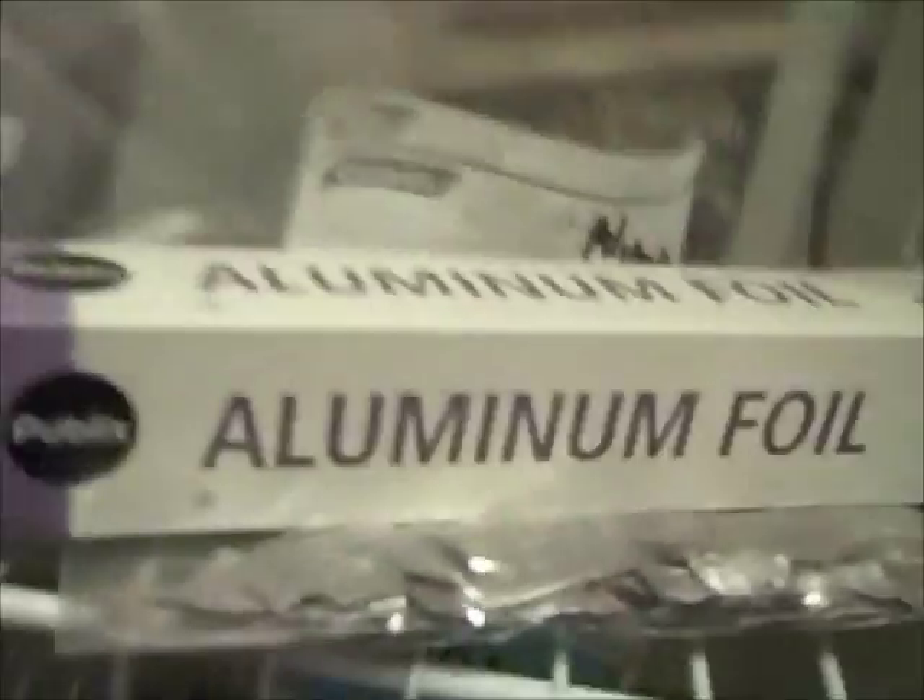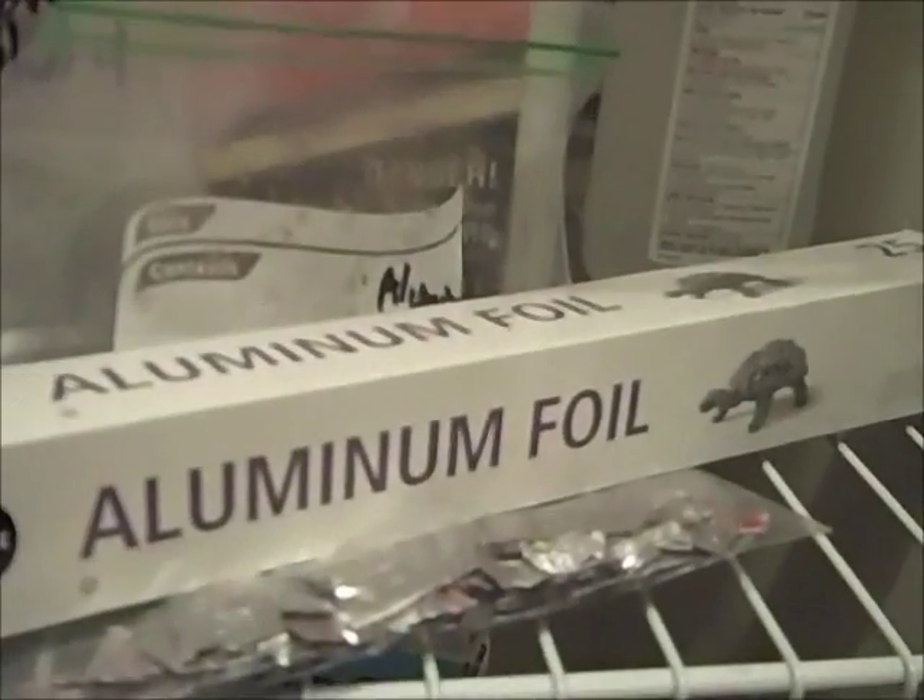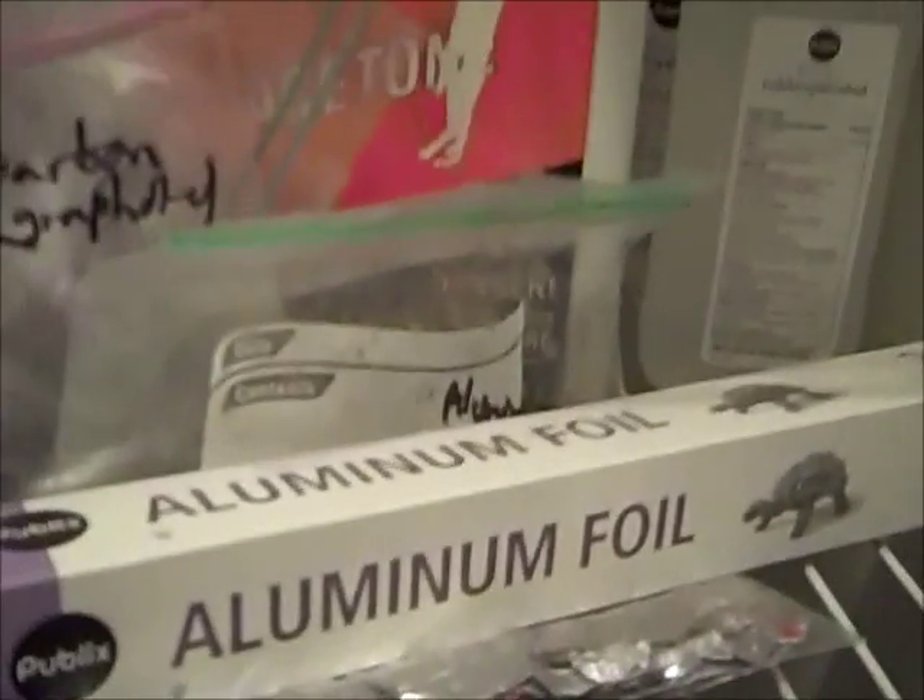So aluminum metal in the bag is a ground-up, sanded-down-to-the-best-of-my-ability coat can. It's kind of pure. And I also have some aluminum foil that you can get almost anywhere, which is better. Just don't get the heavy-duty stuff because that has impurities in it.